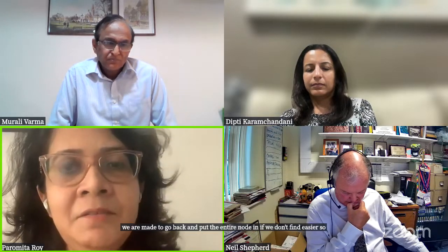Now, again, there may be different rules in different specialties. Yeah, go ahead. Sorry, Parmita. So I was going to comment on that. First, to answer Dr. Chetty's question: because of extracapsular extension, the management changes, and radiation guidelines are different whether ECE is present or absent. We are made to go back and put the entire node in if we don't find ECE. So yes, even with grossly positive nodes, we have to put it in entirely.